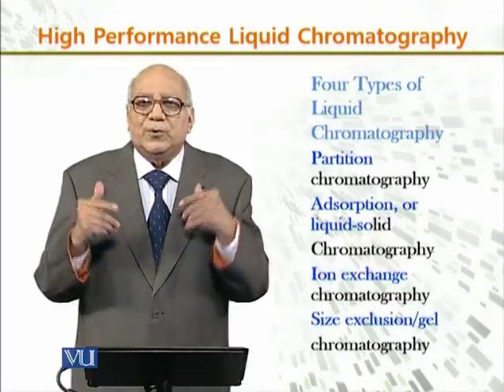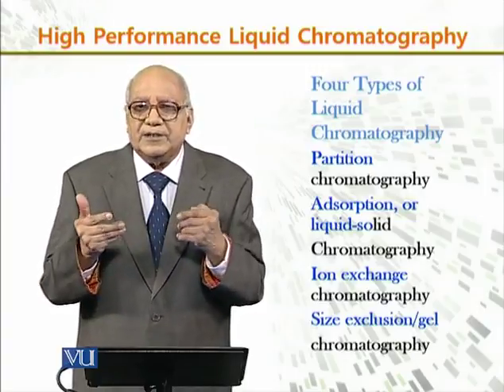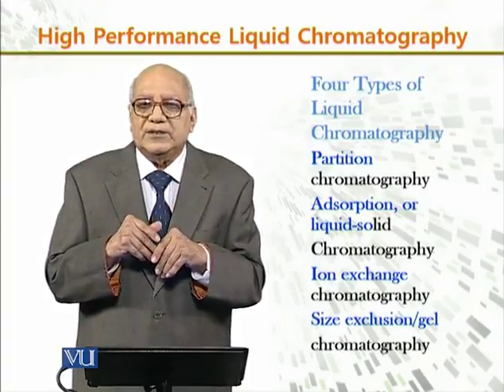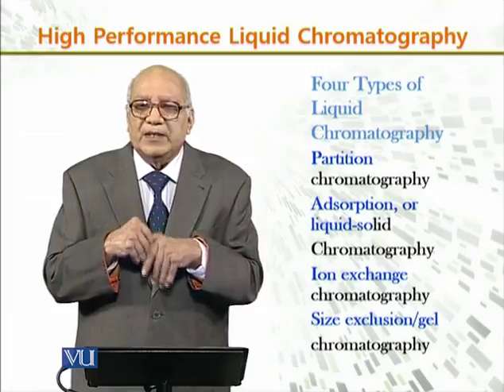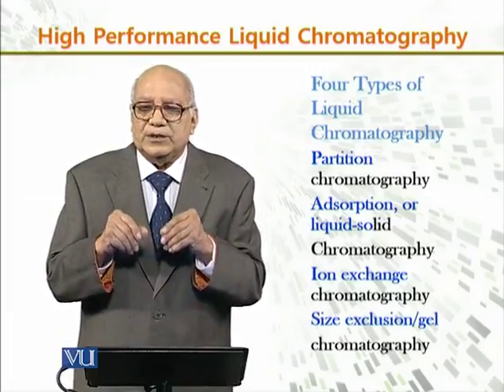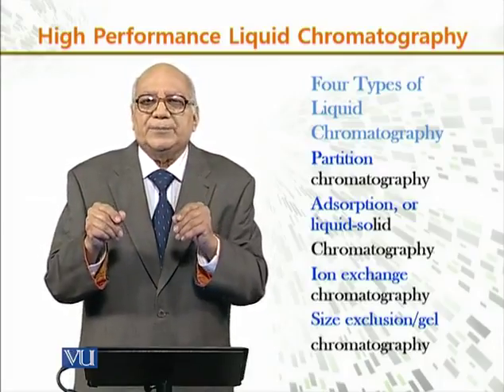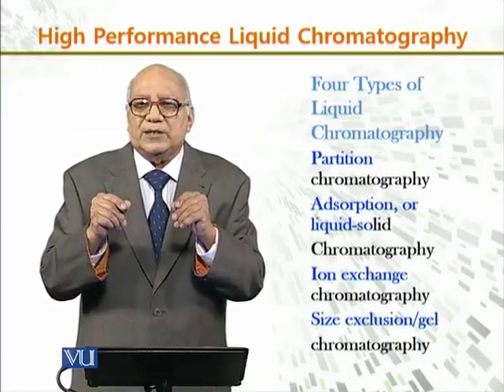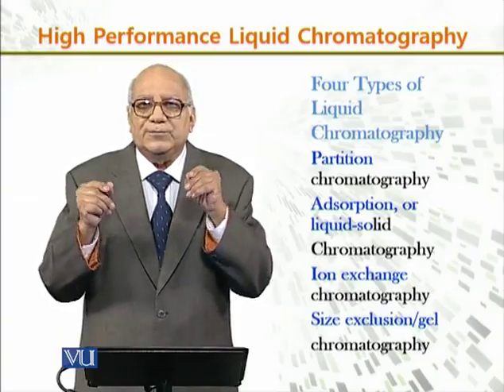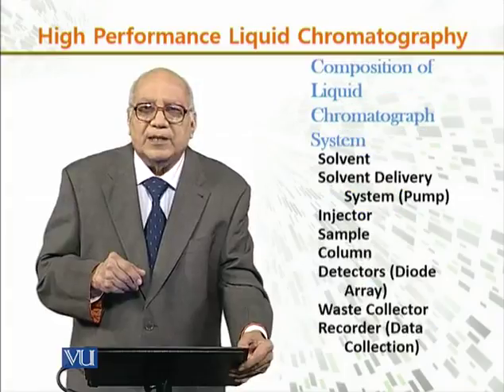Now, the four types of liquid chromatography are partition chromatography, adsorption or liquid-solid chromatography, ion exchange chromatography, and size exclusion or gel chromatography. These are the different types of chromatography techniques which are frequently used in the analysis of molecules.